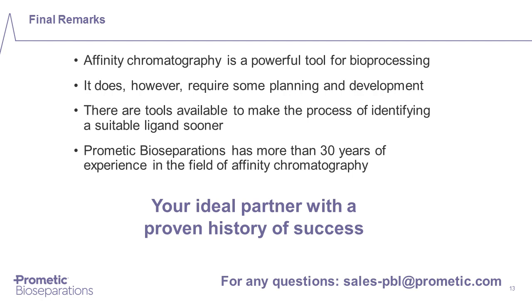So they are very similar to each other in size, and that makes the flow properties very predictable and very good. So even if the ligand is the same, the performance of the adsorbent is most of the time beneficial with this nearly monodispersed material.